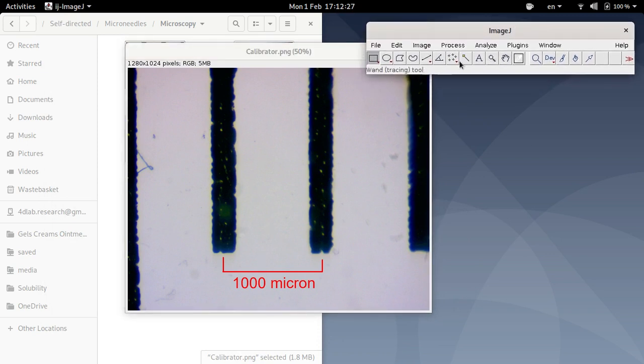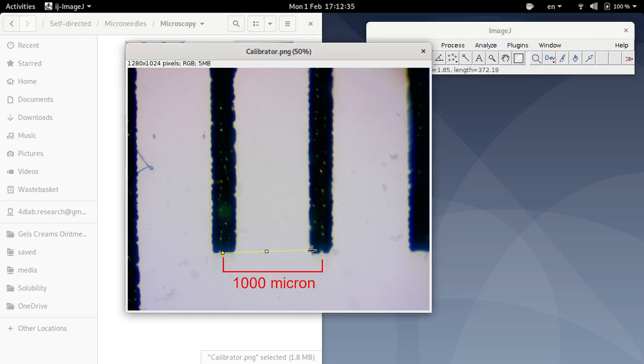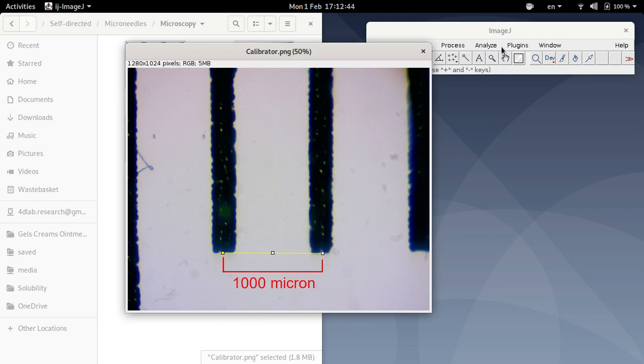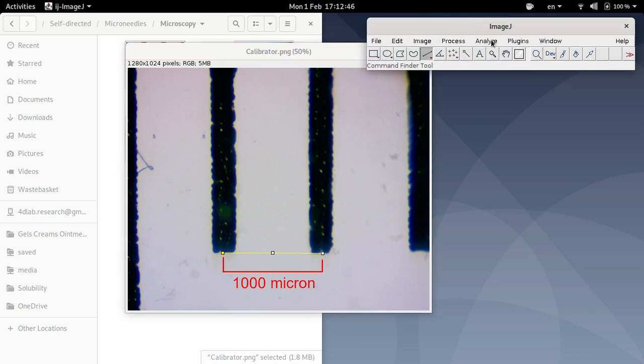So to do that we need to draw a line. So I'm going to click that icon there, draw a line from that point to that point. Okay, so now we know that that line is a thousand microns in real life.